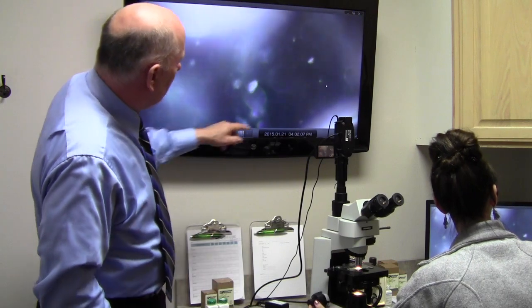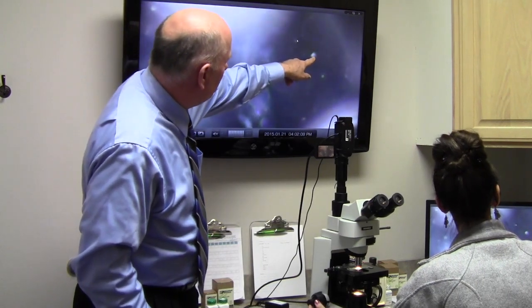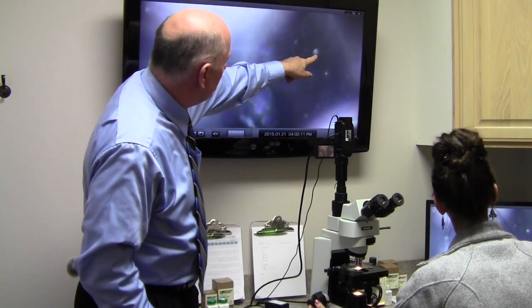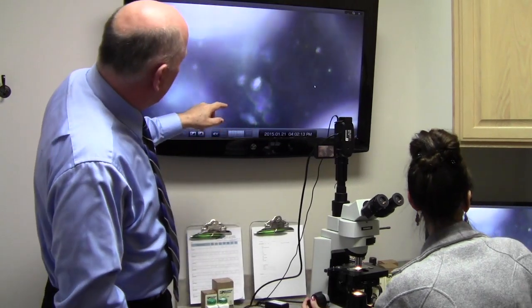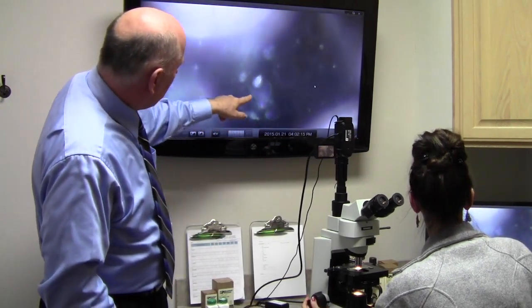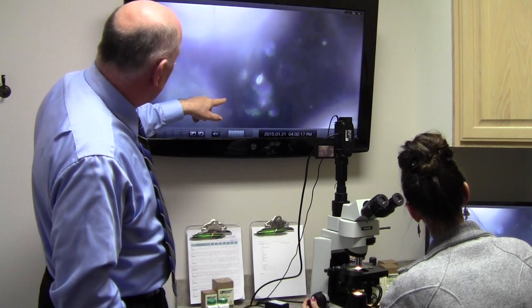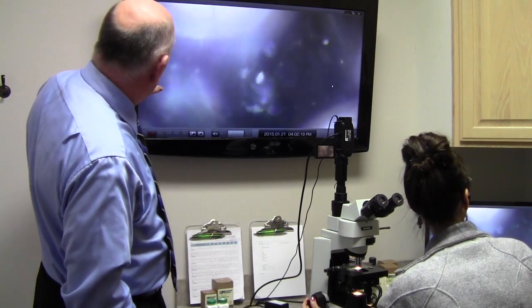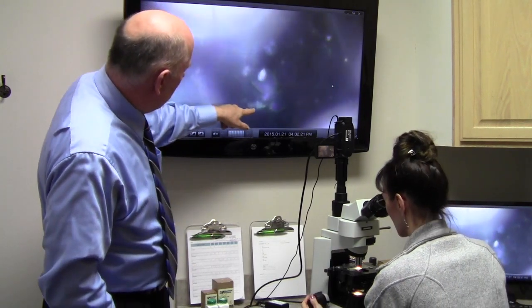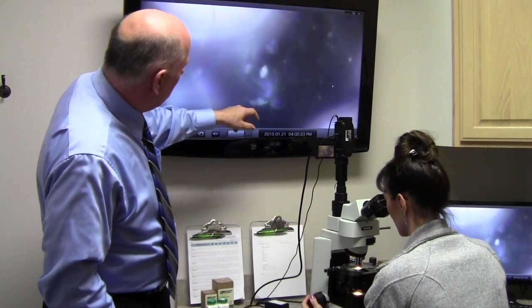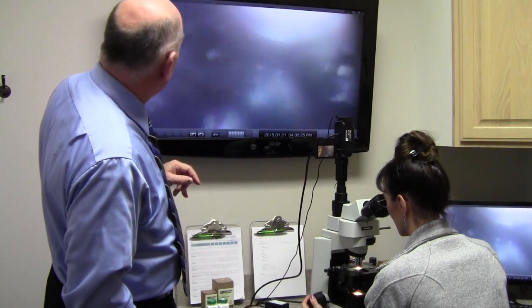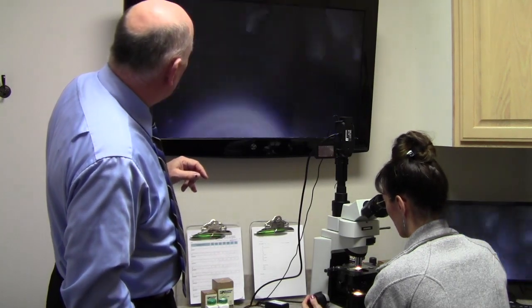Right here, here. There's a, what's that, a parasite? A parasite. Another parasite. More over here. Where's one of those biofilms?